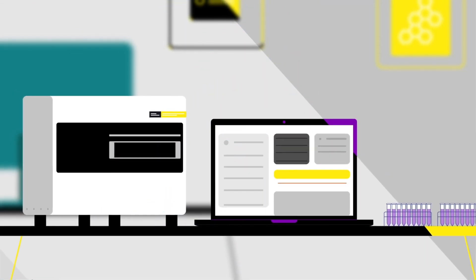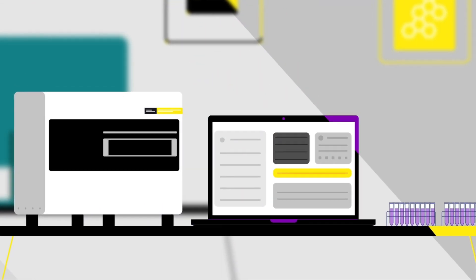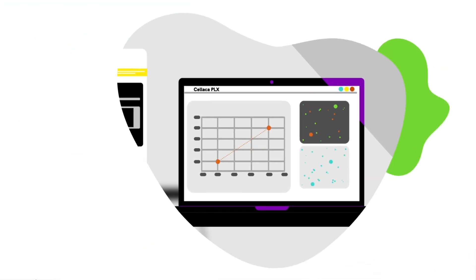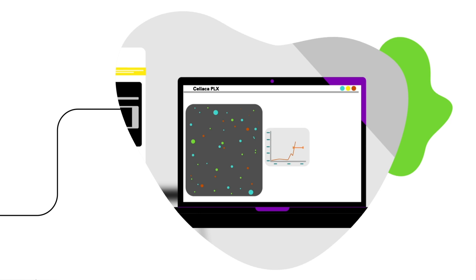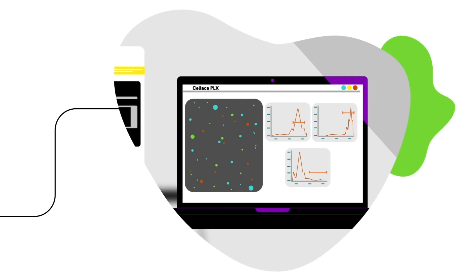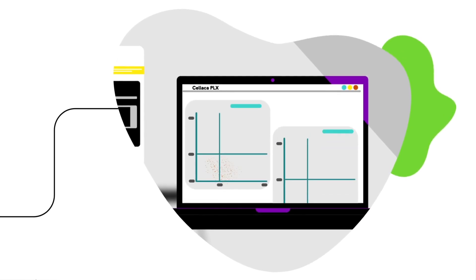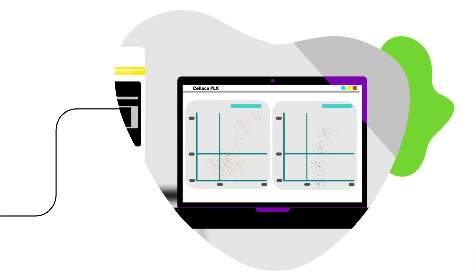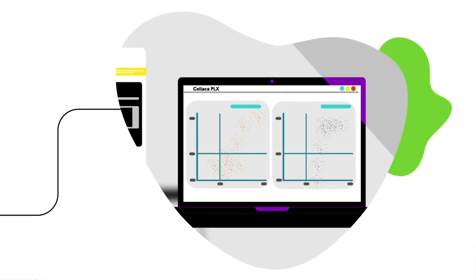The Cellaca PLX Image Cytometer enables high throughput, accurate cell counting, and multiplexed assays in a faster, benchtop solution.